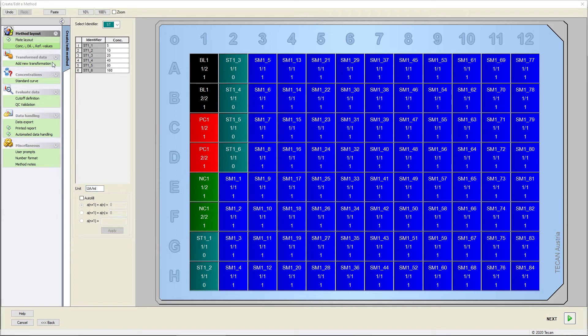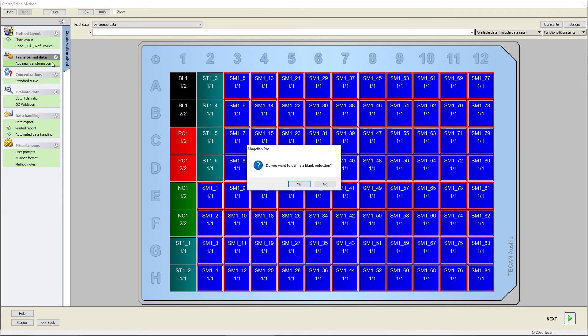In the Transformation wizard, you can define formulas for data transformation. Magellan will automatically ask if you want to perform a blank reduction in case a blank is defined on the plate layout.